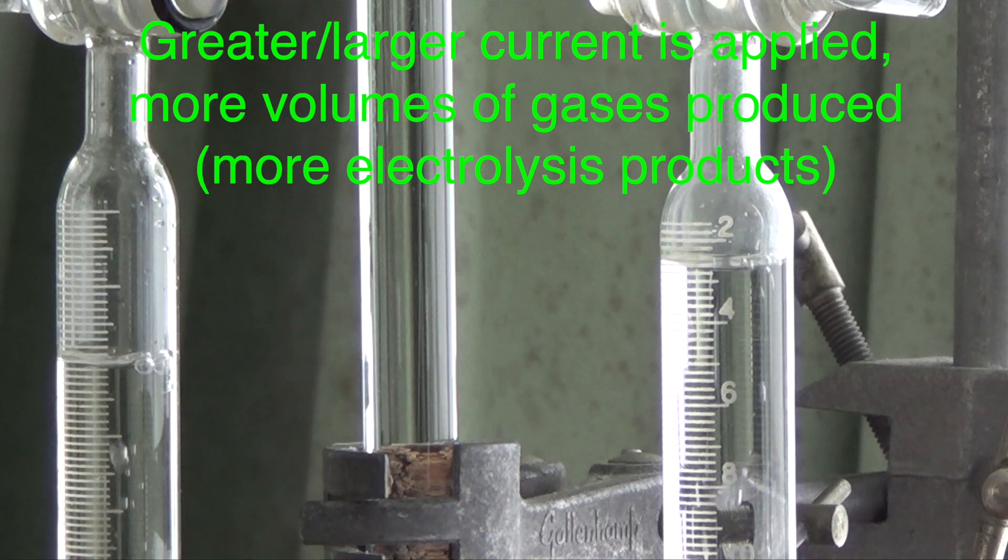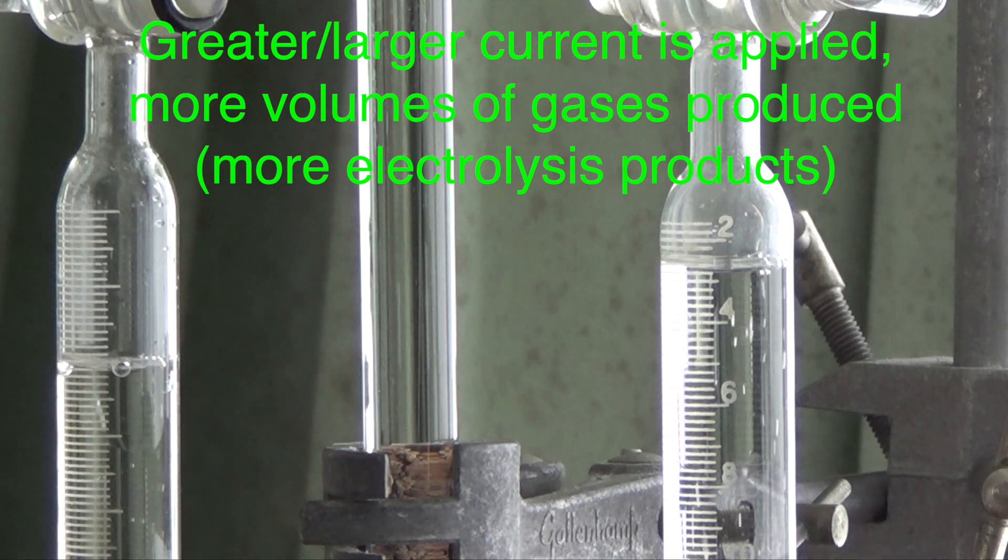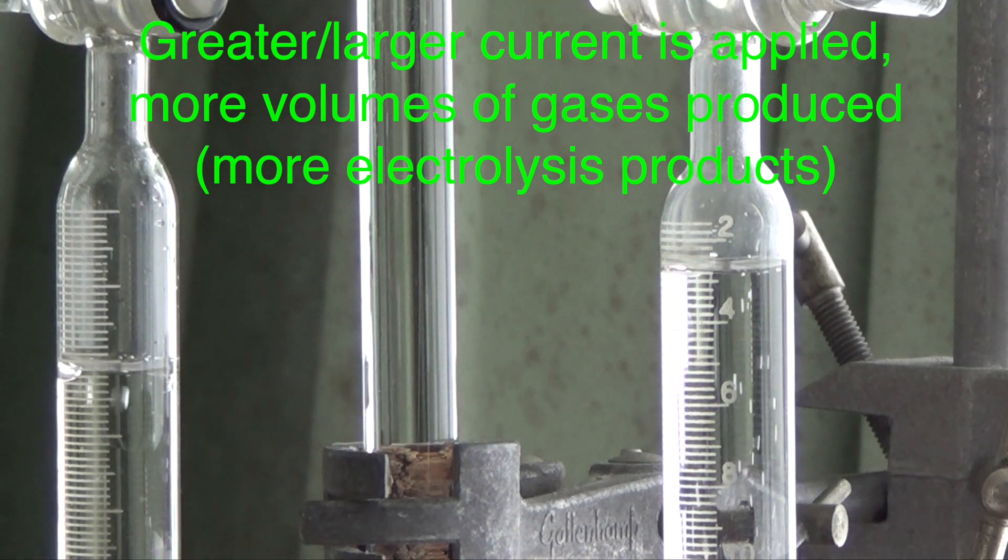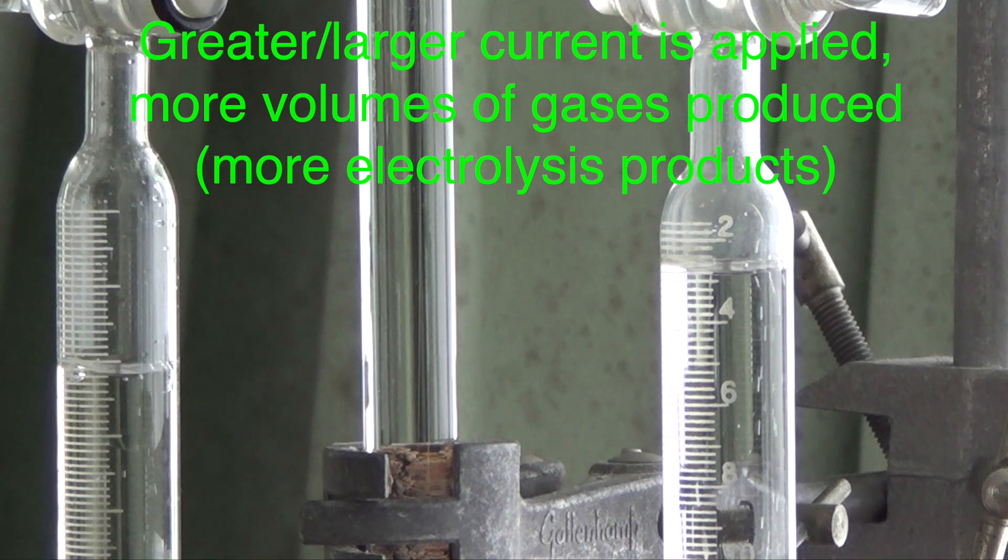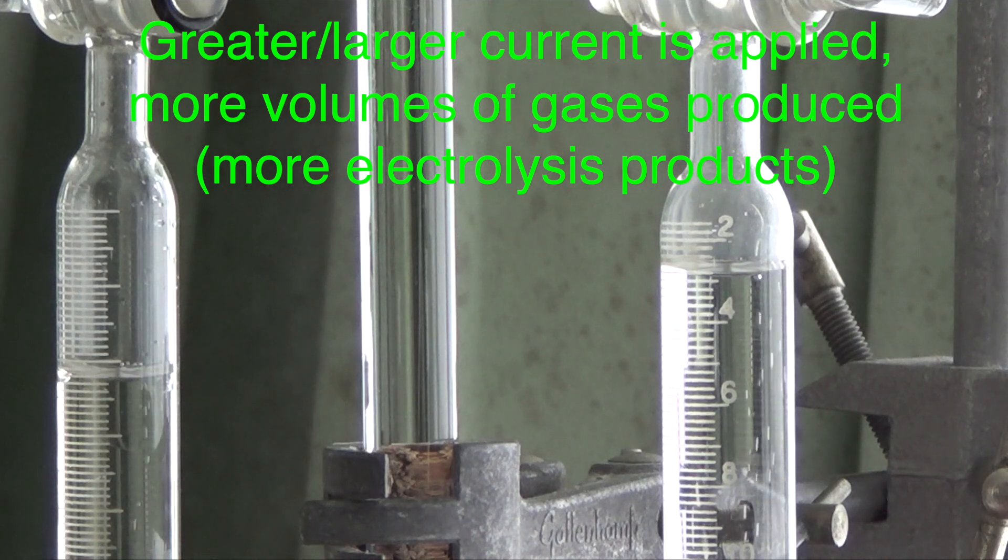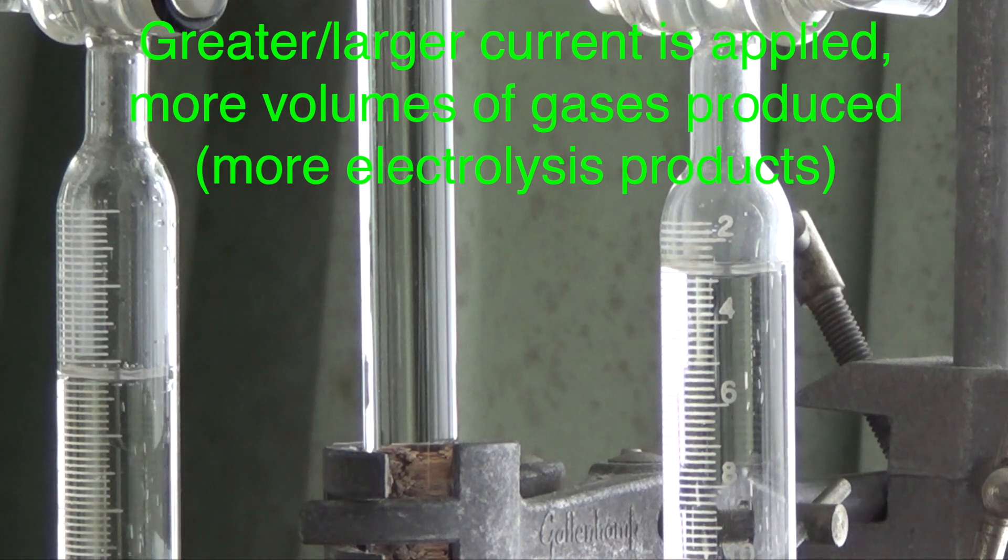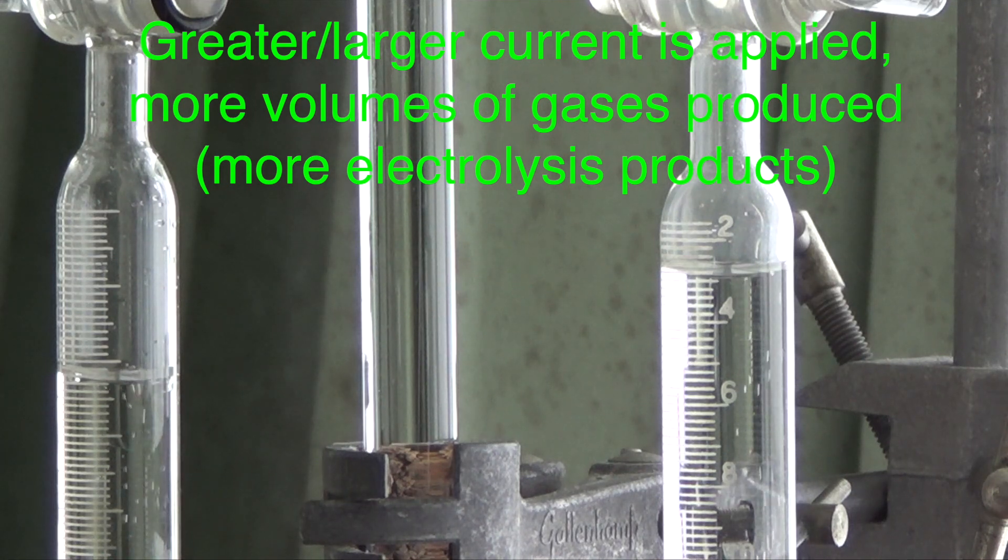So this is the current decreased by a little bit. It's getting a bit slower because lesser current means lesser charge, lesser charge passing through, therefore lesser electrolysis. I'm just going to decrease it a notch further. This is current being decreased a notch further and it's getting even slower. So how much product you get over time depends on how much current actually passes through. I'm going to decrease the current even further and you can see it's much slower.